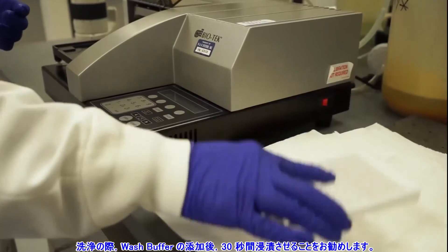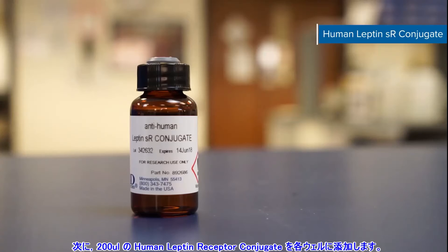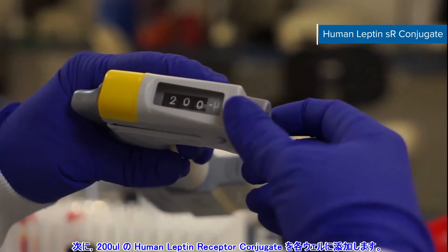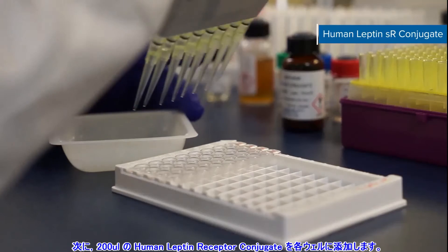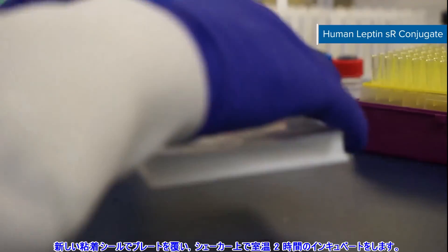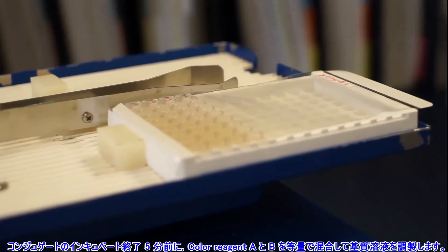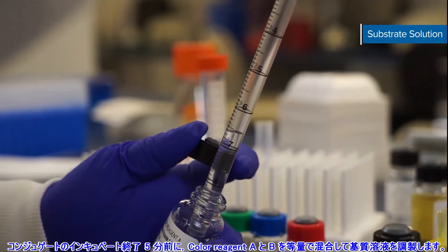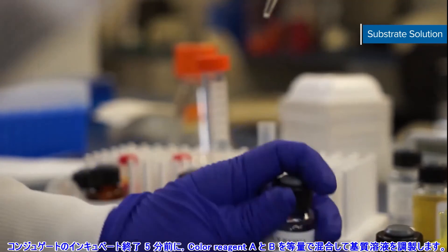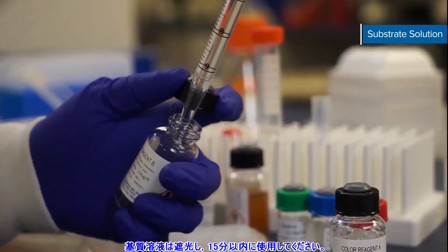When washing, we recommend adding a 30-second soak period after adding wash buffer. Next, add 200 microliters of human leptin receptor conjugate to each well. Cover the plate with a new adhesive strip and incubate for two hours at room temperature on the shaker. In the last five minutes of your conjugate incubation, prepare your substrate solution. Mix together color reagents A and B in equal volumes. Substrate solution must be protected from light and used within 15 minutes.